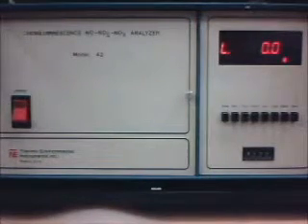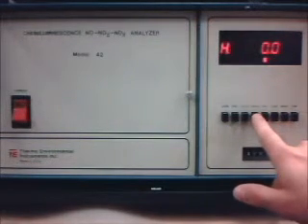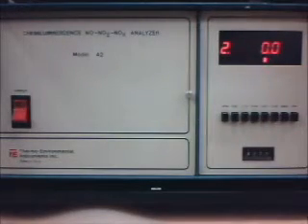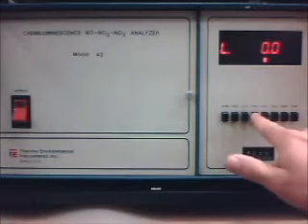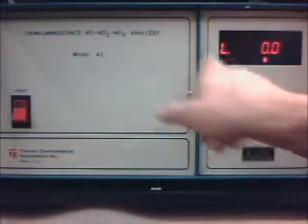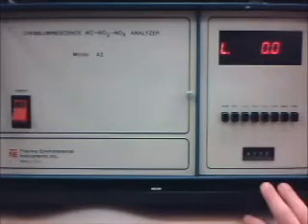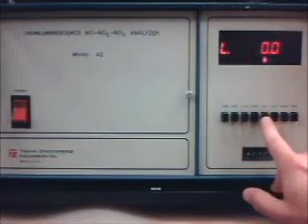I don't know which ones they mean. Anyway, yeah, oh, here's the 2. So right now there's 3 different ones, L, H, and 2. And it starts on L, so I'm assuming L is NO, H is NO2, and then 2 is NOx, but I could be mistaken. Anyway, that's the calibrate button.